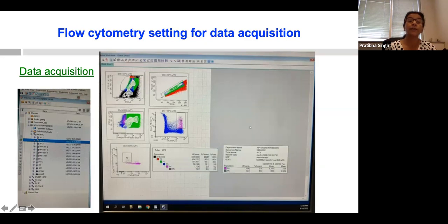The cells are inside the axis, not too much over it, with a very nice spread. We gated these cells as lymphocytes, and then I gated this population to exclude doublets.